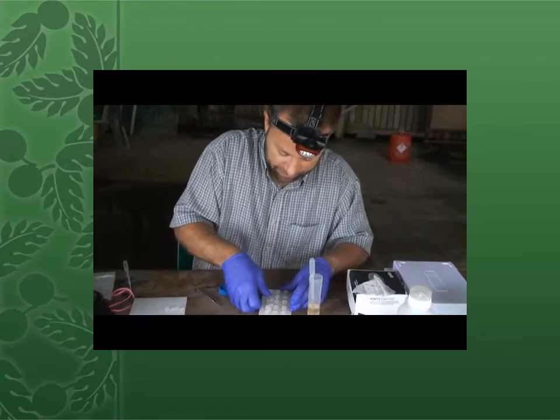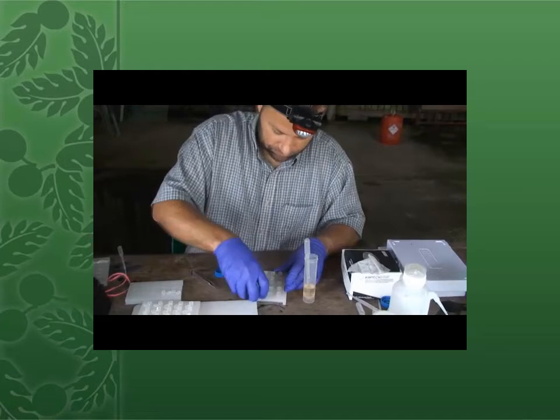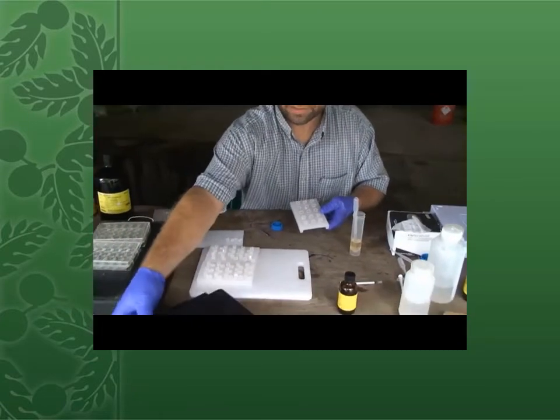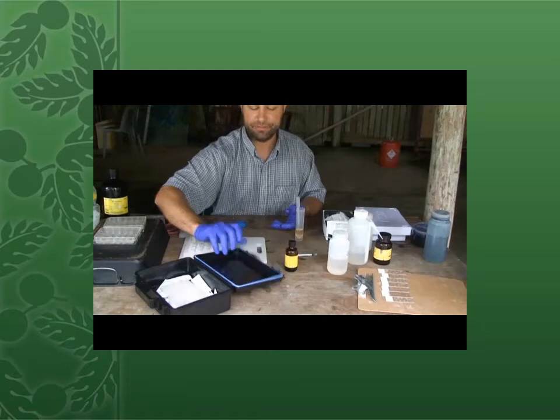Close the beam capsules and put them into a desiccating chamber, which here is nothing more than a diver's dry box with some desiccant packets.